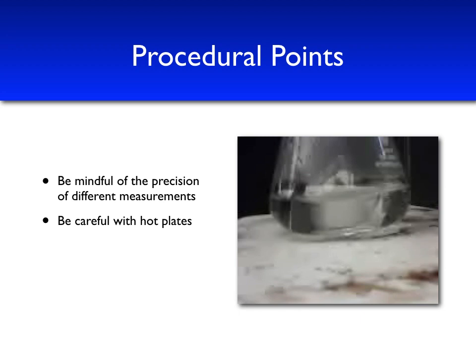As mentioned before, it is important to be very careful with hot plates. In this experiment, two hot plates will be used. One hot plate will be used for heating up the solution, and a second hot plate will be used as a stirrer only, to be used for cooling down your substance.